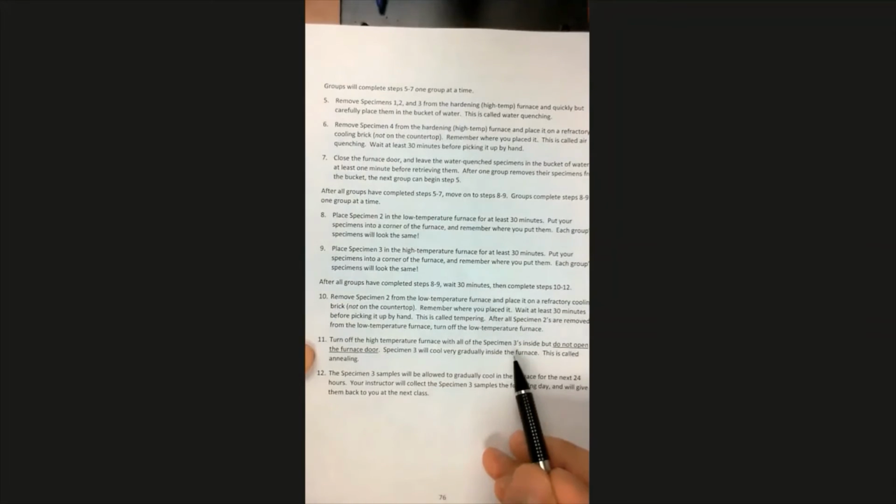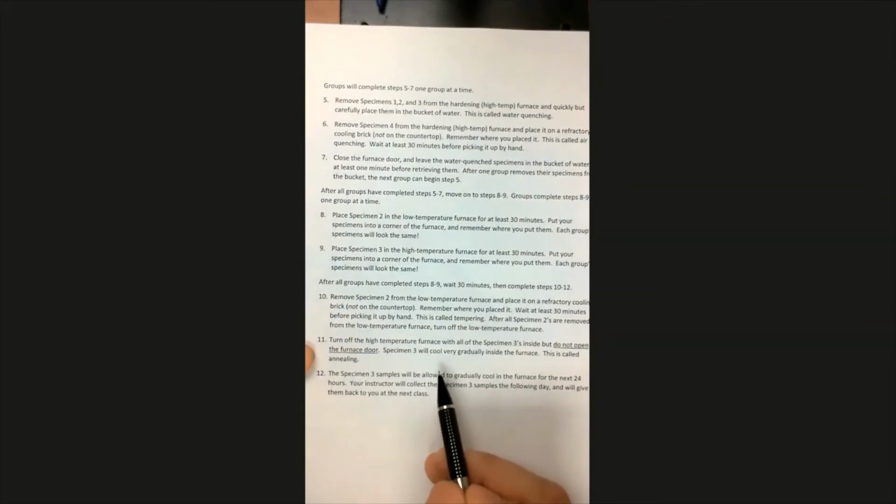Specimen 3 is going to be annealed, and remember, to anneal something, we want to heat it up above the upper critical temperature, but the really critical thing about annealing is you let it cool down really, really slowly. So even after that 30 minutes is up, we're going to leave specimen 3 inside that high temperature furnace, and we're just going to turn off the furnace. That's all we're going to do. We're not going to open the door to the furnace. We're just going to let it cool down gradually as the furnace itself gradually cools down over the next 24 hours or so. And that's annealing.